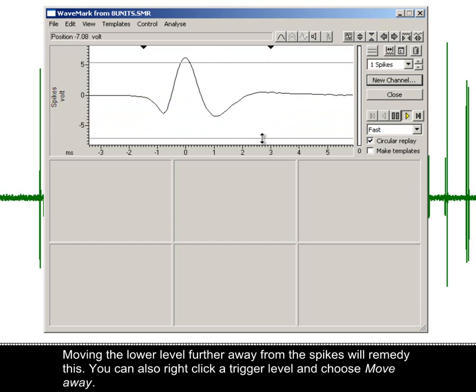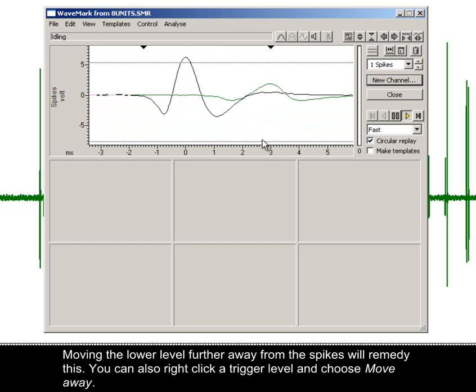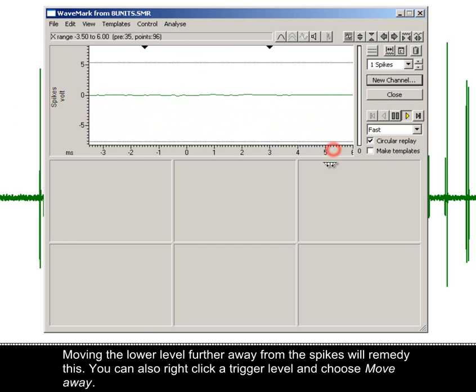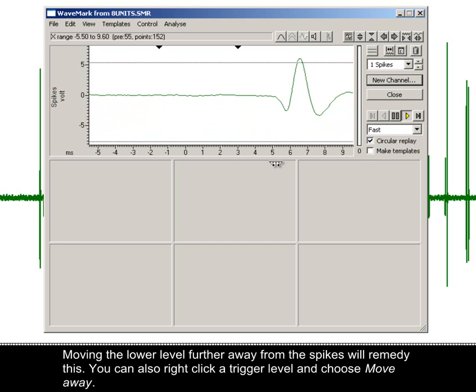Moving the lower level further away from the spikes will remedy this. You can also right-click the trigger level and choose move away.